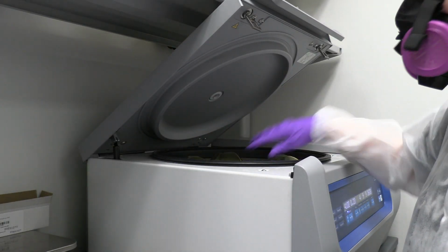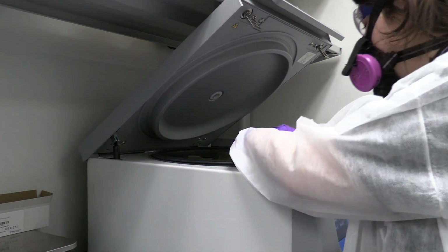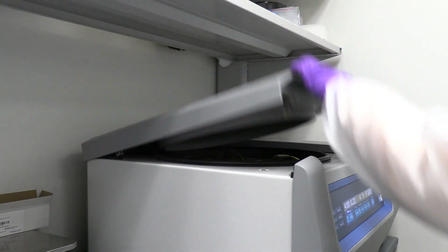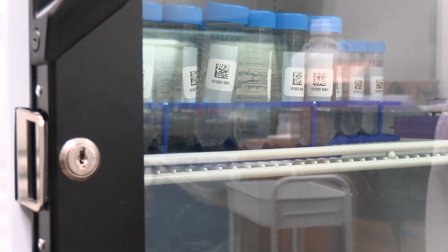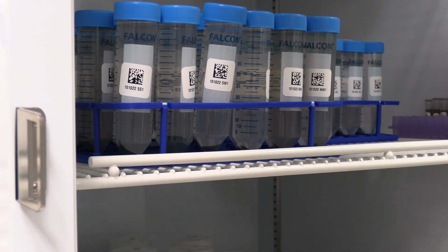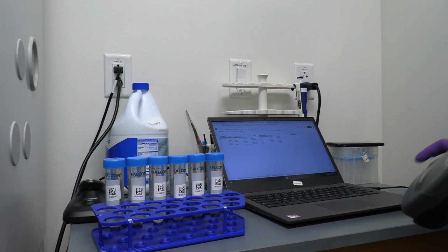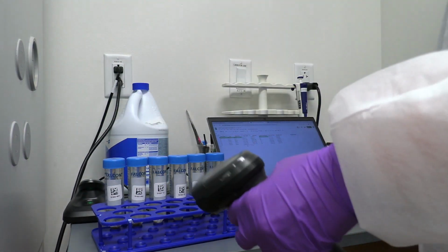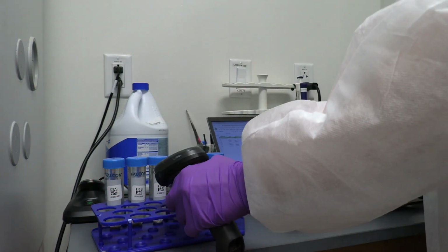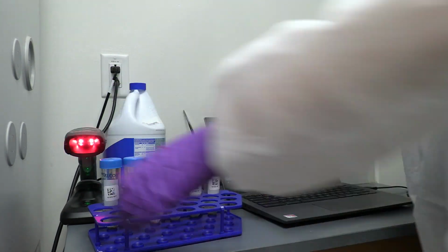Centrifugation is an effective method used to separate solids in a wastewater sample from the supernatant or liquid fraction and further purify and concentrate viral particles prior to concentration. Samples are stored at 4 degrees Celsius until further processing. Proper storage of samples is important to minimize viral degradation and increase the utility of wastewater surveillance. When ready to be concentrated, samples are scanned into a laboratory information management system, or LIMS, that allows us to easily and effectively track samples and attach associated data.